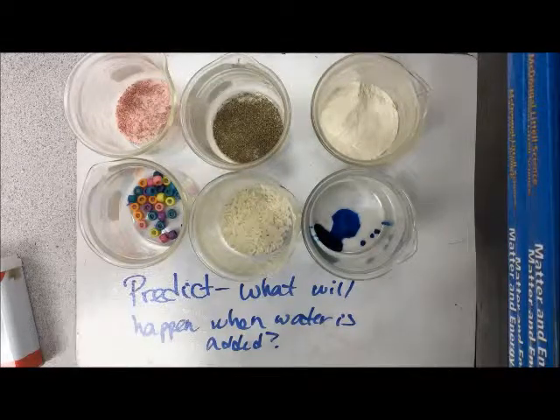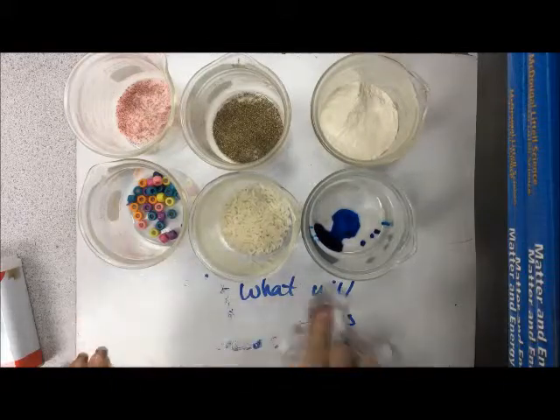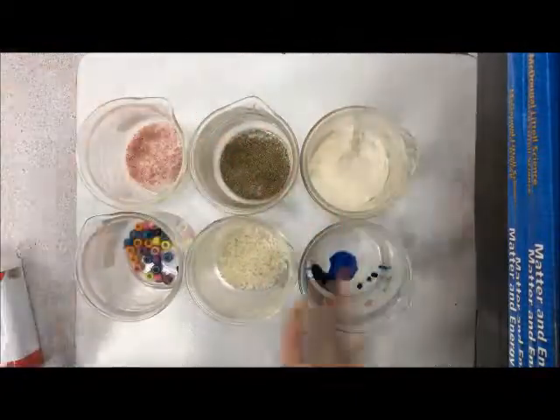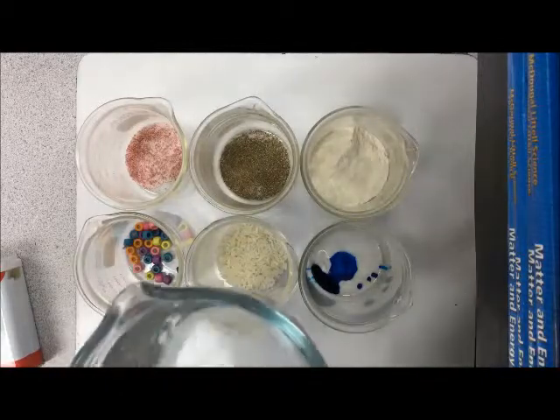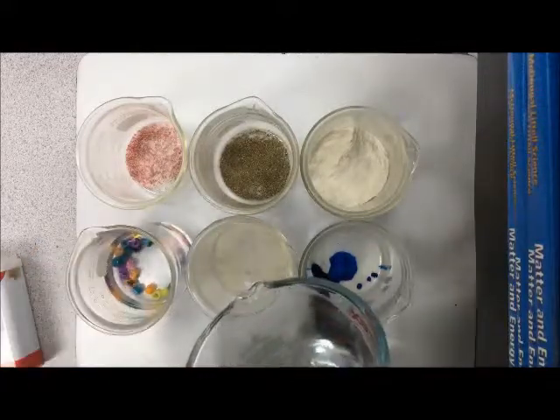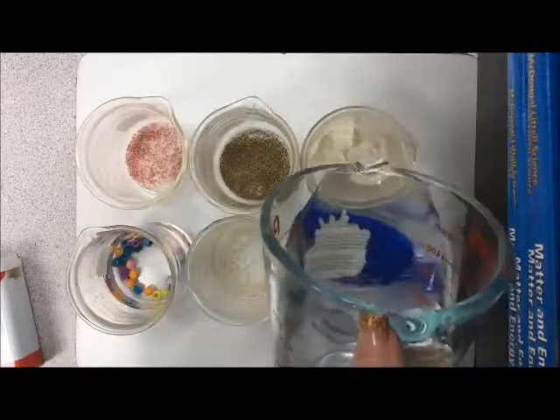Did you pause? Okay, so make sure you have your prediction. Okay, so what's the point? Why are we doing this? You're going to understand soon enough. We all have our reasonings for doing this. In the real classroom, it's a little bit more fun to do because you get to see what happens. But in here, I'm going to go ahead and add the water so that you can see. So I'm going to add water to each of these containers. And let's see if your predictions indeed came to fruition.